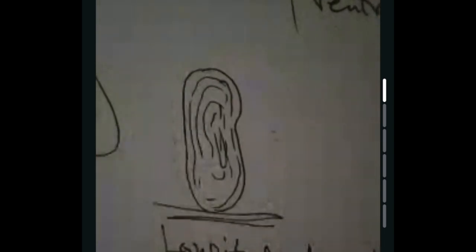So these are the tissues inside the mango. I cut it vertically, the vertical section. So I got all this. This section I'm looking at is known as the longitudinal section.